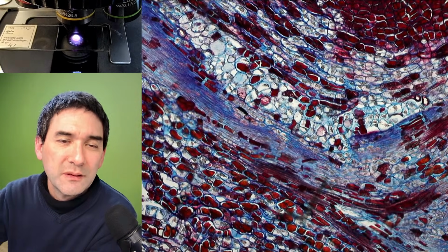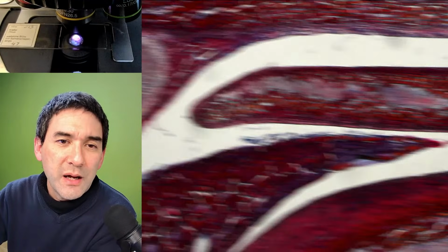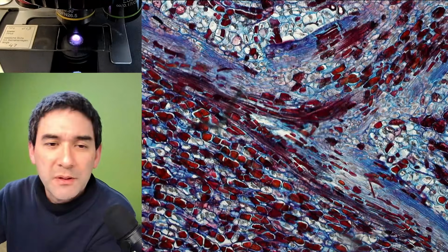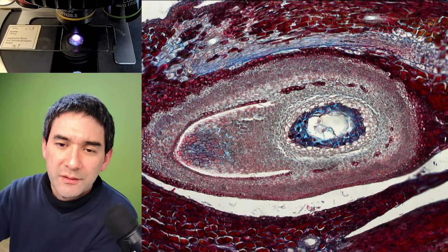So where is the scope view here again? I need to refocus it a little bit. Yeah, also properly stained, properly prepared. And those round things here, I suppose, must be the ovules, which will then develop. I think this one over here will then develop into a seed.